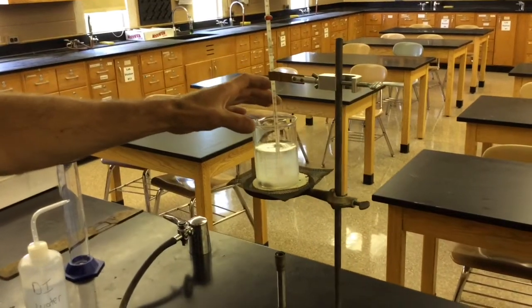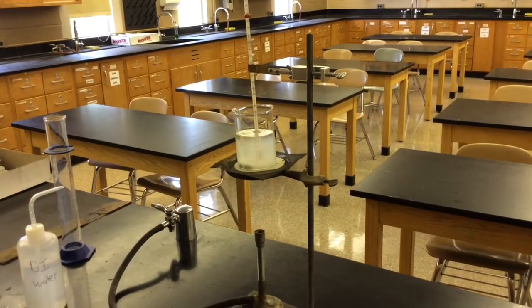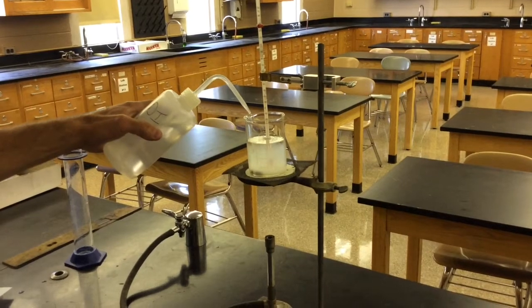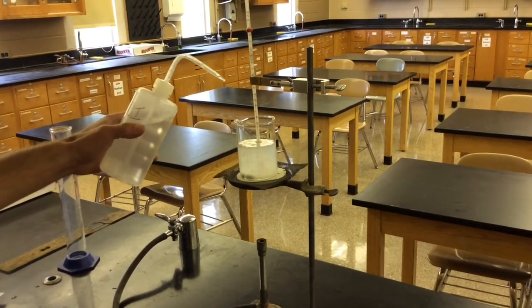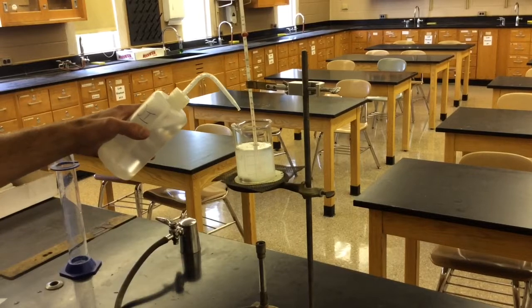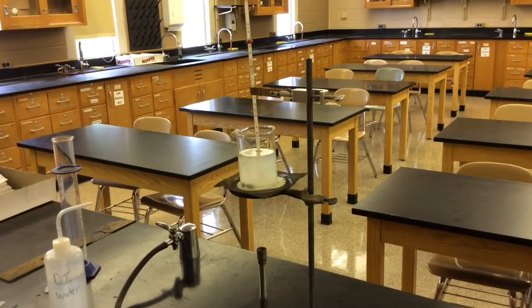Do not take the beaker off and dump the hot water out, because then you're going to have to reheat it again, and it's just going to take more time than it needs. So what I would do is add water to make up for the amount that you lost. And what actually would work better is if you add the water before you add in the salt. Bring it back up to about 150 milliliters on here, then dump the salt in and turn the Bunsen burner on and start it heating again.